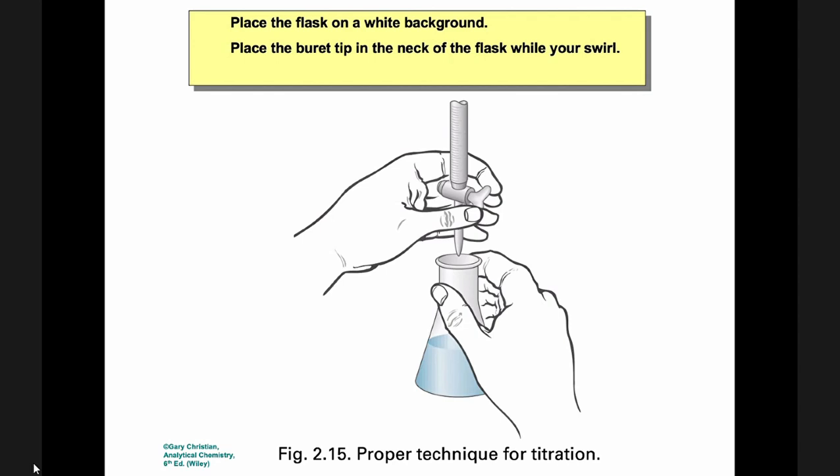So one analyst in our lab will show you the standardization of your titrant against the primary standard. Wasn't it already discussed, up to titration? Determination of whatever, if you will determine alkalinity or do neutralization reactions, depending on the lab activity. So place the flask on a white background.